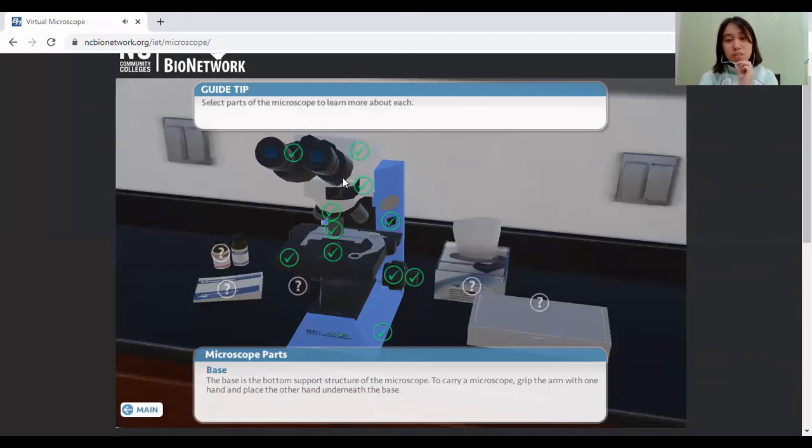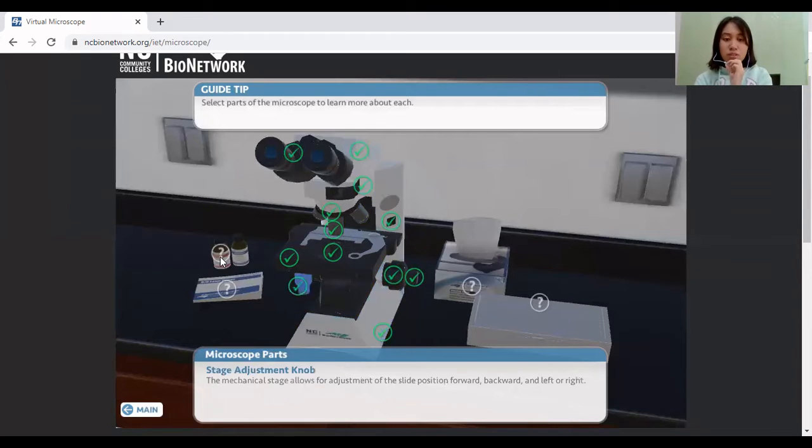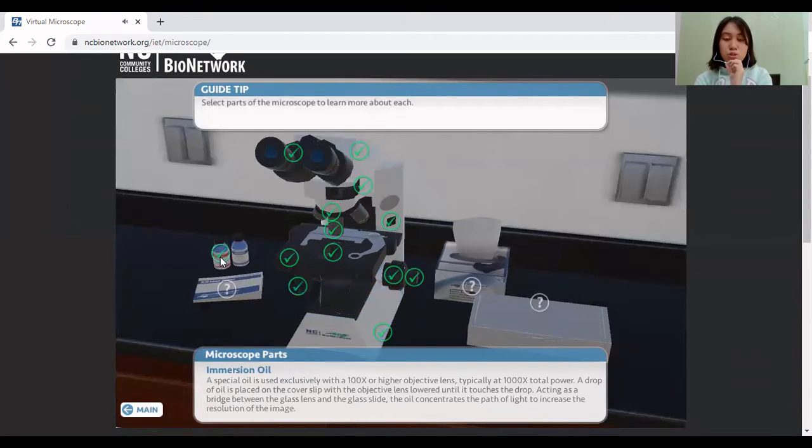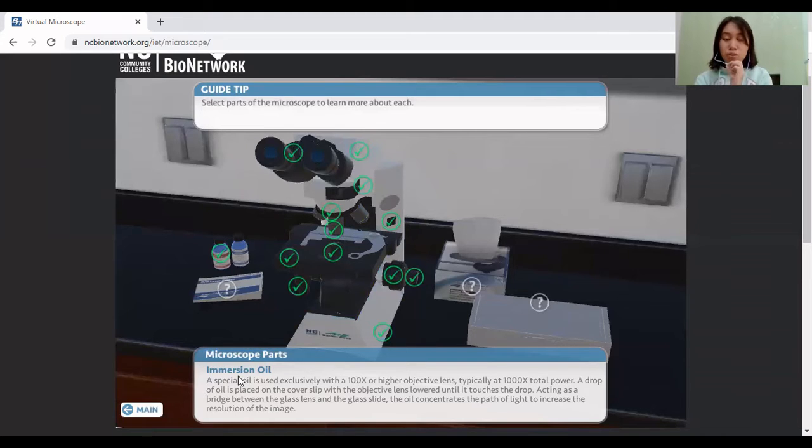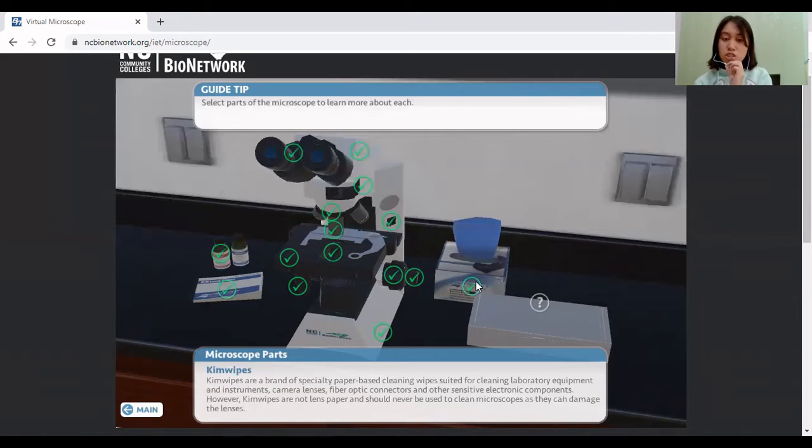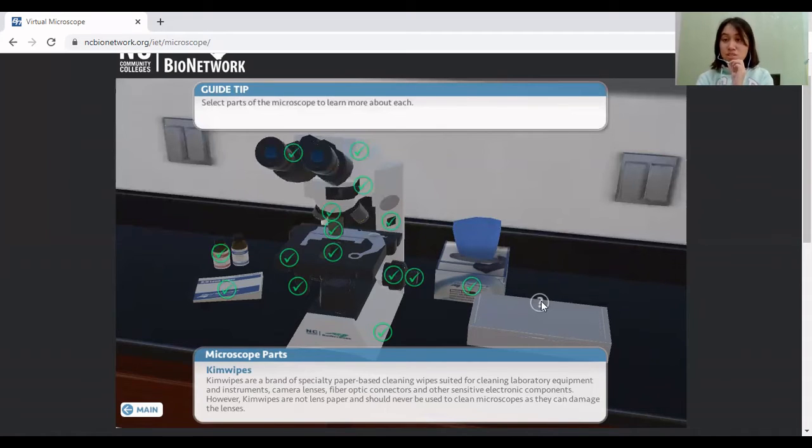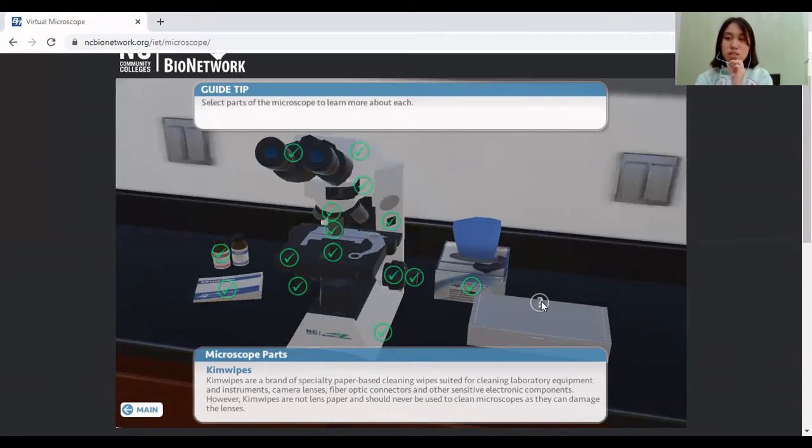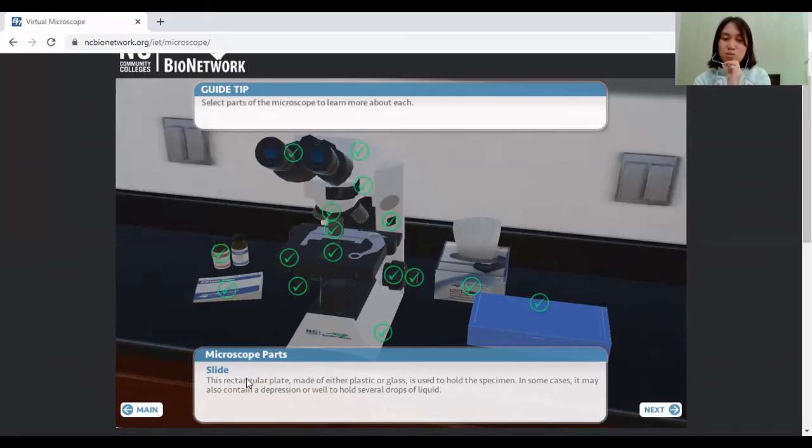Now here, we have different materials in the side of the microscope. So first, we have the immersion oil. If you want to put your lens into a highest power, you can use this material. We have the lens paper right over here used to wipe the lenses or to clean the lenses of your microscope. For this Kim Wipes is a special paper-based cleaning wipe that is used for cleaning your laboratory equipment. And of course, the most important part to examine the samples through the microscope is the slides. This is where you put your samples and your specimen.